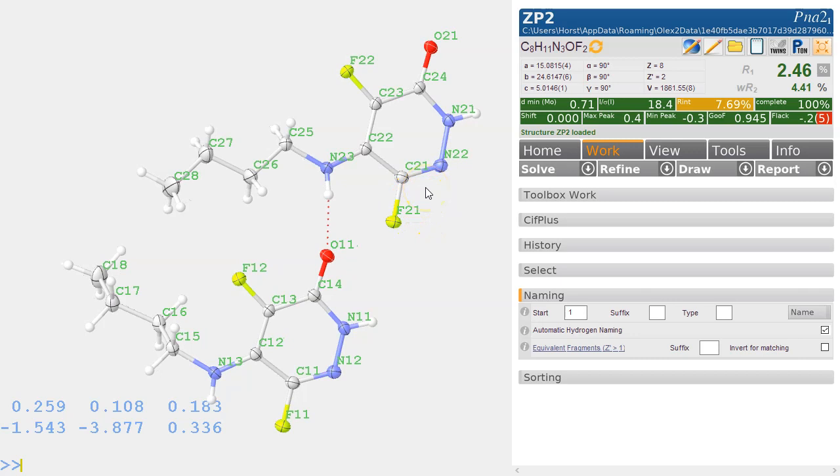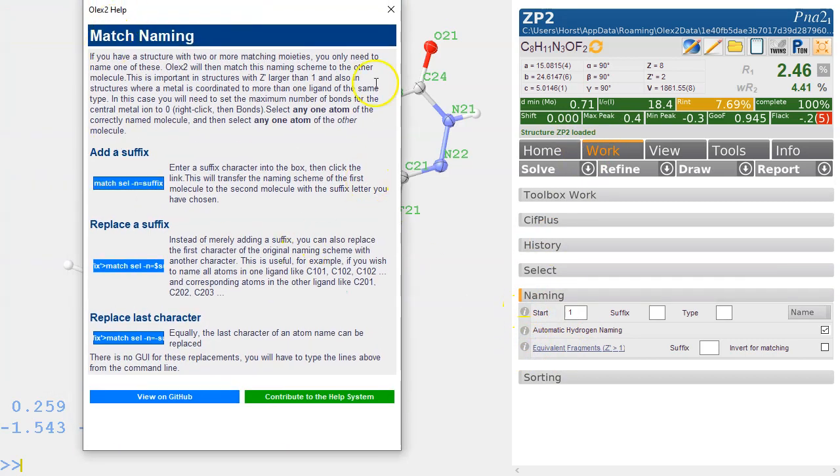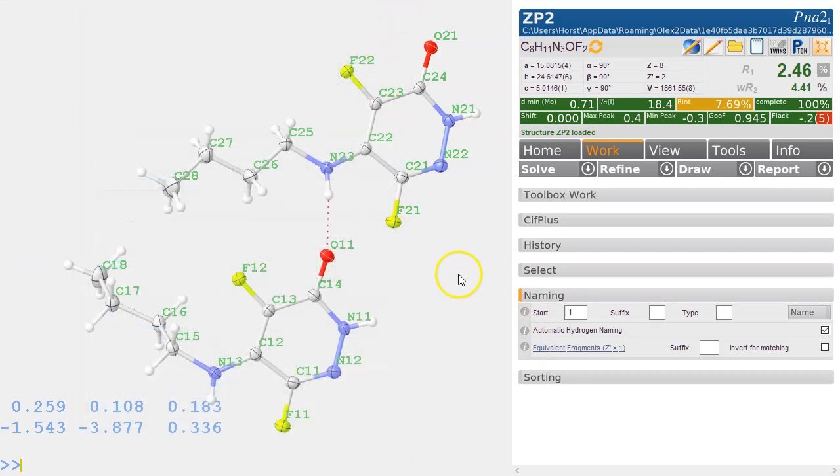It is quite flexible, a little bit confusing sometimes, but there is a bit of help. If you click on this info symbol in work naming, there is actually a fair bit of help, so if you're lost you can have a look over there.